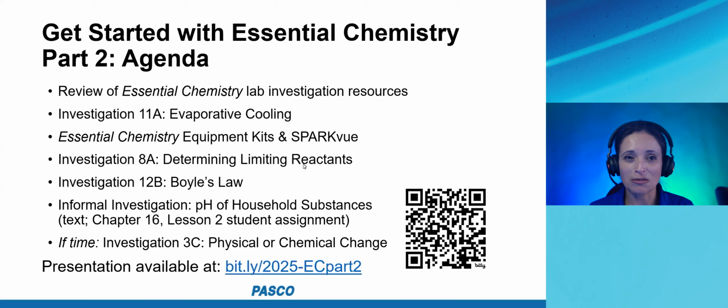It's the beginning of the year, so if I have time, besides Boyle's Law, I will also introduce you to the pH sensor and an investigation that comes early on with sensors, physical or chemical change, depending on if we have time. But I'm definitely going to introduce you to the pH sensor with pH of household substances, and we'll do a Boyle's Law investigation as well.